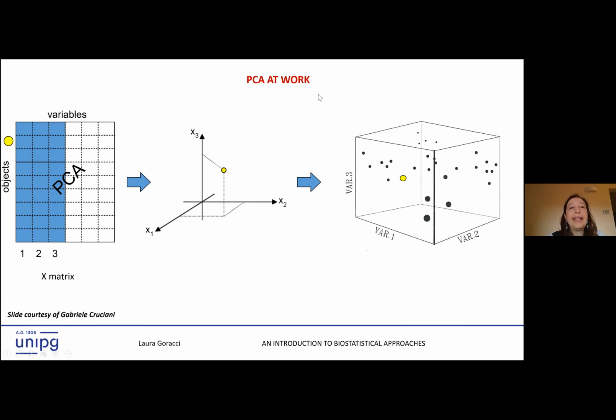And now, instead of explaining how PCA works using the matrix explanation or mathematical approaches, with linear combinations of variables and so on, I prefer to use here again a graphical approach to understand what is going on. We have our X matrix to run our PCA. We have objects and variables.